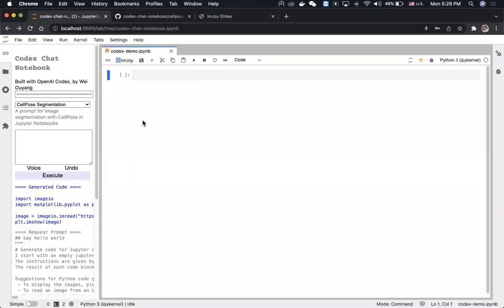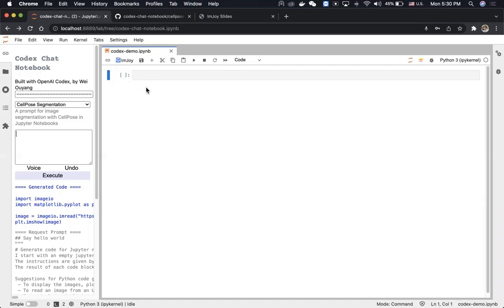I will start by showing you this Jupyter notebook extension we made for Codex. What this tool does is that it takes instructions from the user in English, sends the English text to the Codex server hosted by OpenAI, and then the Codex model generates source code in Python. That code is then executed in the notebook environment.